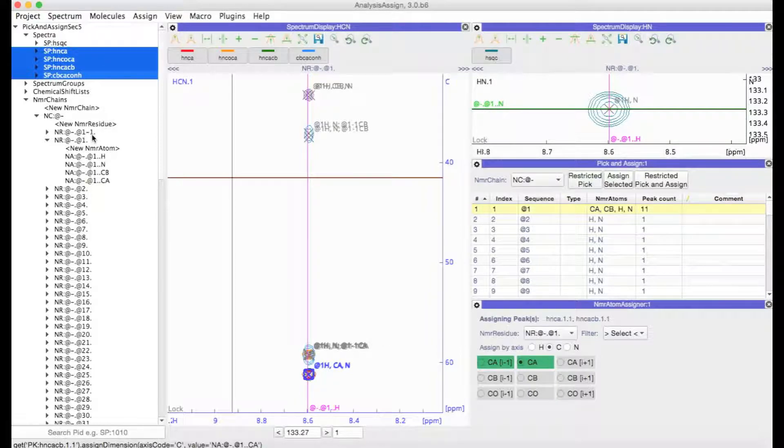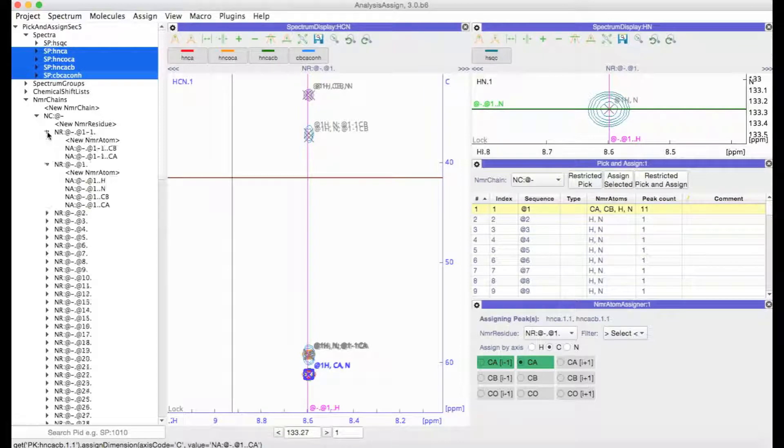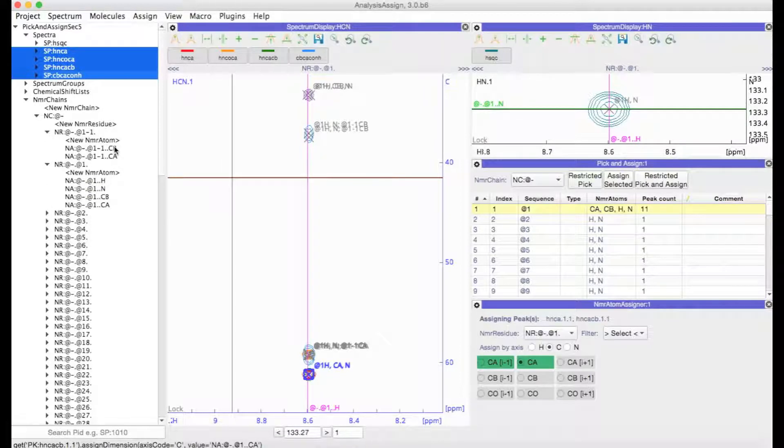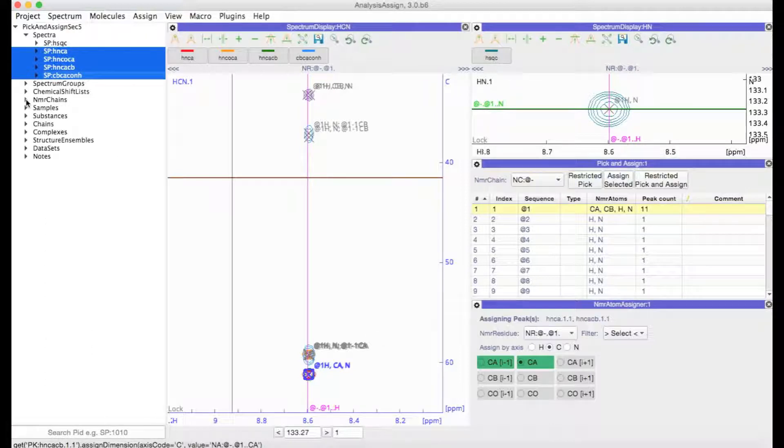You can also see that a new NMR residue has been created called At1-1. And that basically is simply the residue that is previous to At1. It's the I-1 residue and I've got the CbA and the Ca NMR atoms in there.